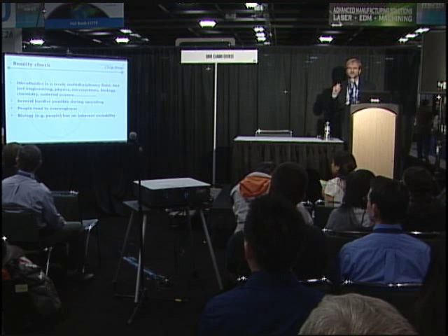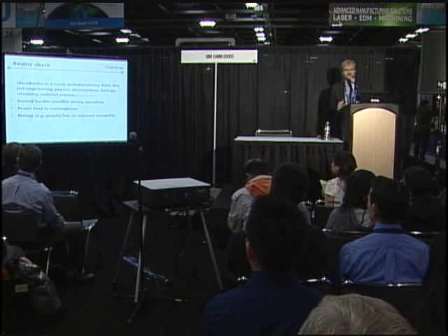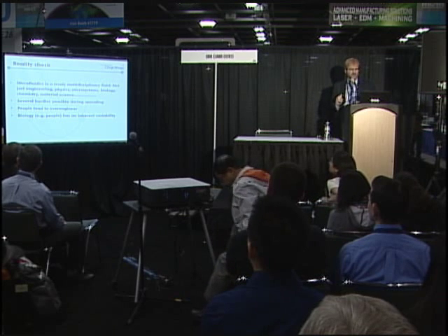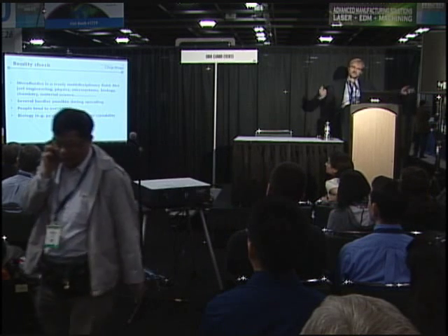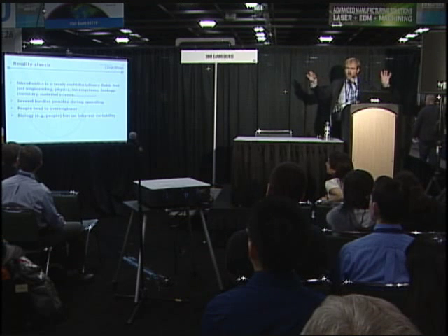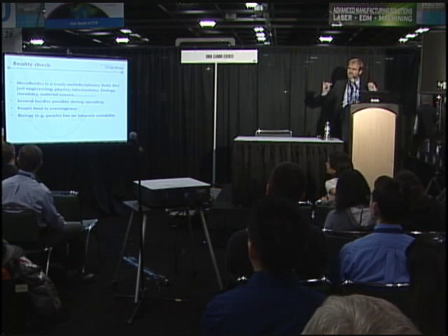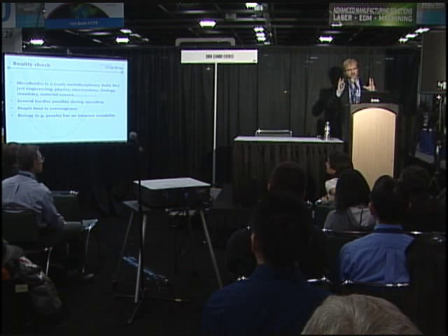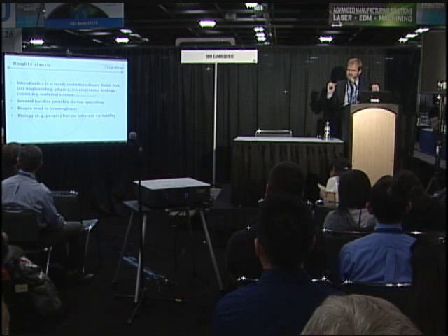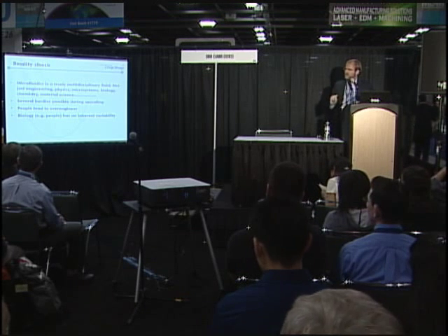The first thing, and that's really by far the most important message, Microfluidics is a truly multidisciplinary field. It's not just engineering or physics or microsystem technologies or biology or chemistry or material science. It's all mixed together. And you really have to combine the resources, you have to combine the know-how in all these various disciplines to really make a successful Microfluidics development.